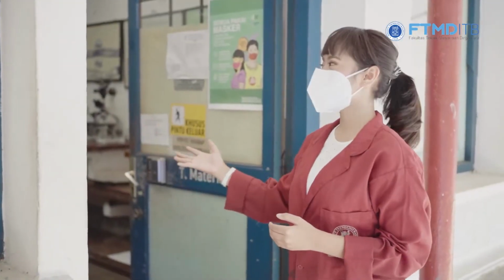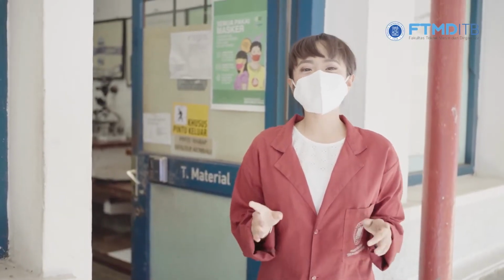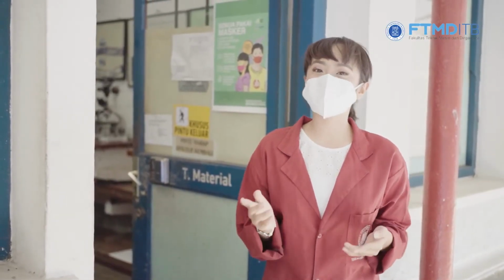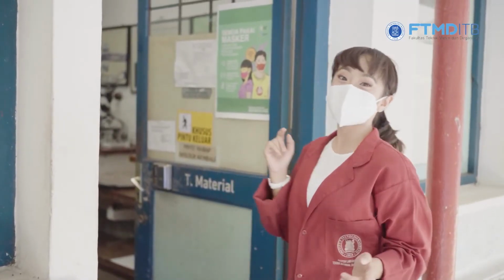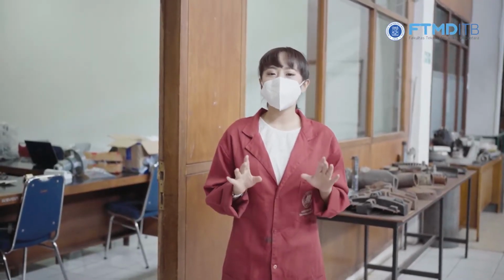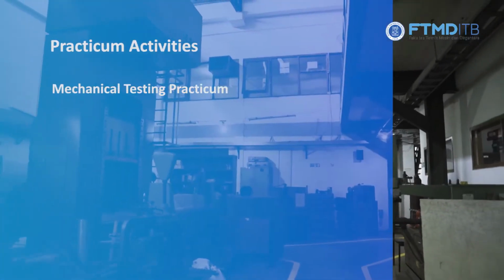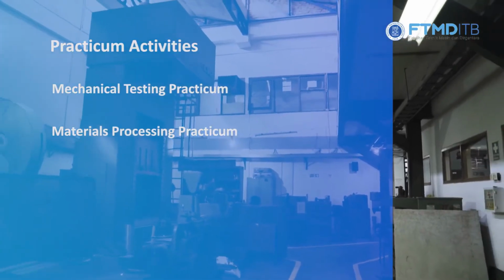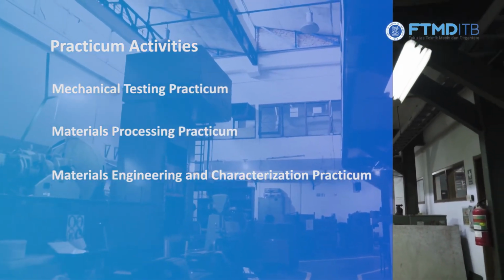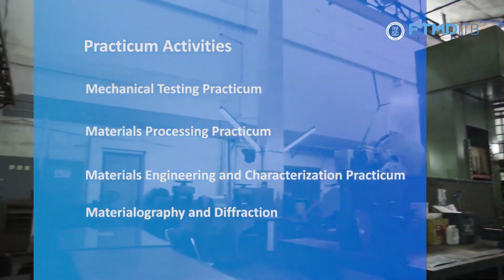Now, we are in front of the Metallurgical Materials Laboratory building for the Metal section. This laboratory is used for practicum or research activities related to metal materials. Let's take a look inside. In this lab, there are facilities that support students to carry out practicum in subjects such as mechanical testing practicum, material processing practicum, materials engineering and characterization practicum, and materialography and diffraction.